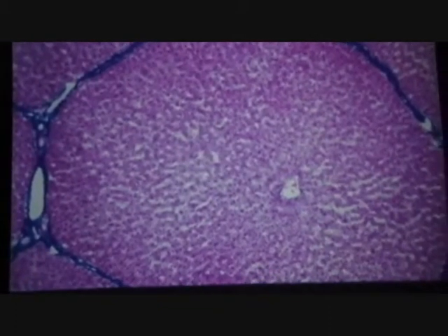Anything else in the portal triad is too small. Never ask me about anything else. The thing with other mammals, you have connective tissue around the lobules, which you don't find in humans. Actually, a lot easier to find lobules in other mammals.